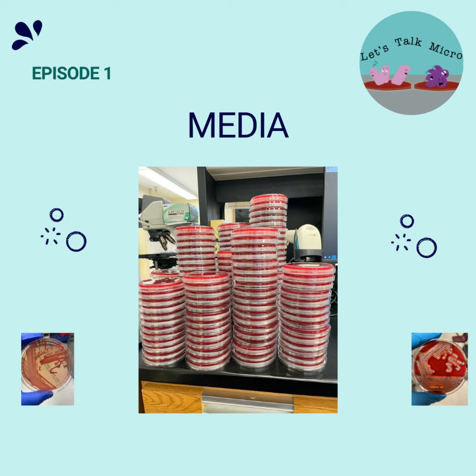A great example of this media is blood agar. Every student in basic micro, when you get started in the lab, works with blood agar, right? So when I'm talking about blood agar, everyone knows what I'm saying. It has sheep red blood cells, and it is definitely one of the main agars that we use in cultures. I will say that almost every culture panel includes blood agar.